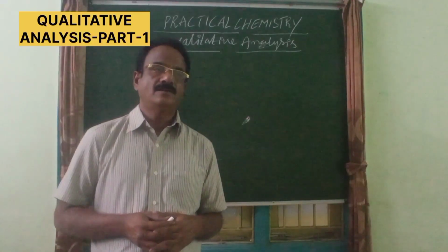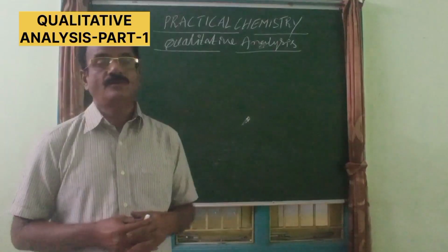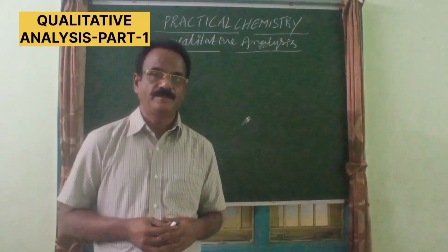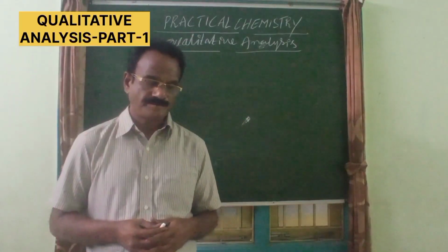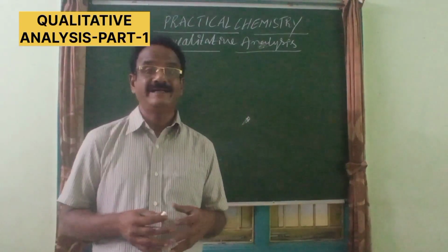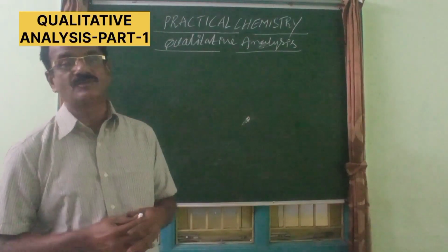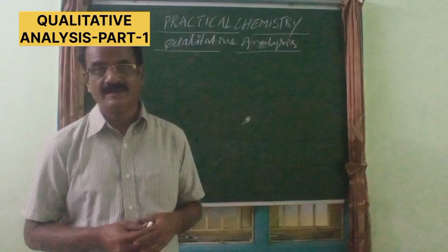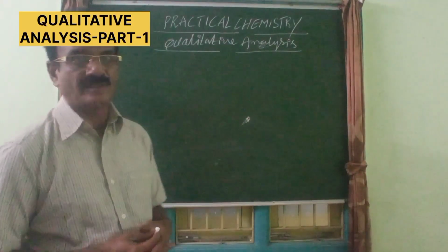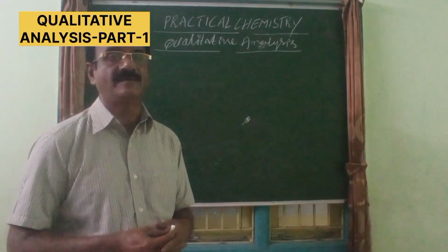So let us see about inorganic qualitative analysis in this video. Here I would like to explain how an inorganic salt can be analyzed by a student in the laboratory. Let us see about the analysis of inorganic salt by means of a systematic procedure.